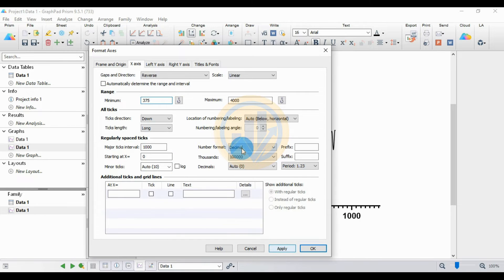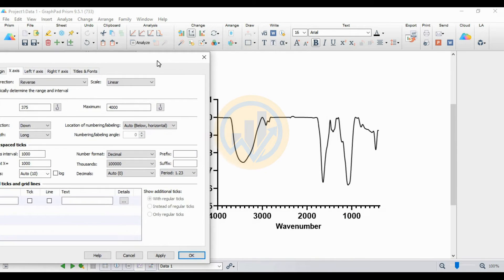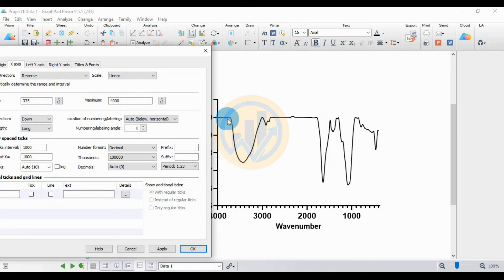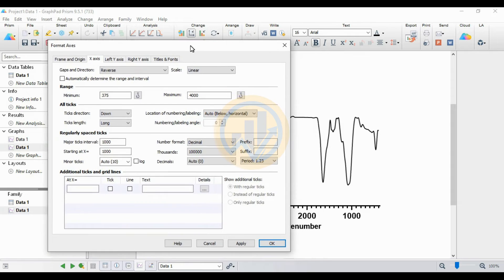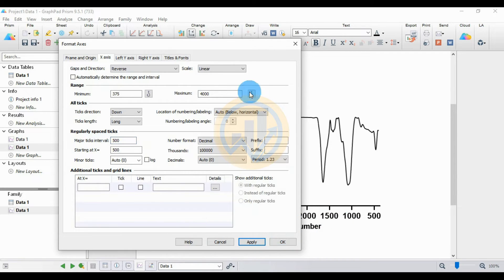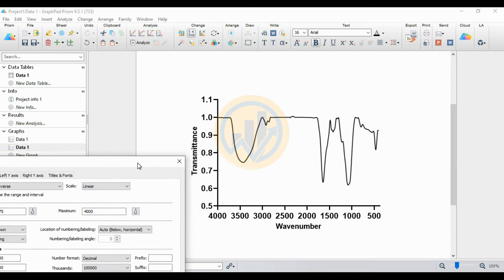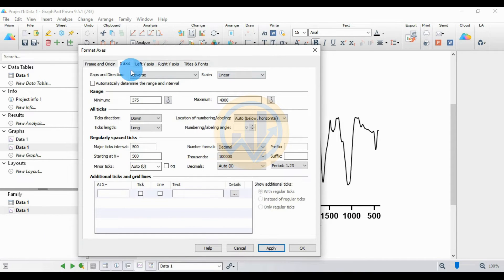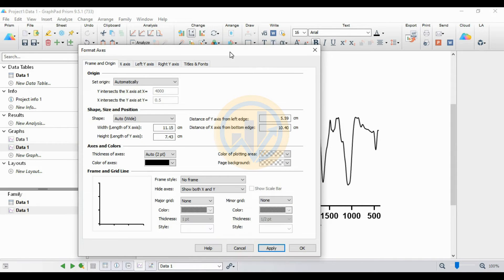Click Apply. The FTIR graph now shows the X-axis from 4000 to 375. Go to the next option: change the major tick interval to 500, then click Apply. This sets the major interval to 500 for the X-axis wave numbers.